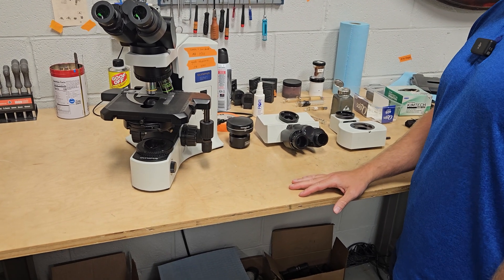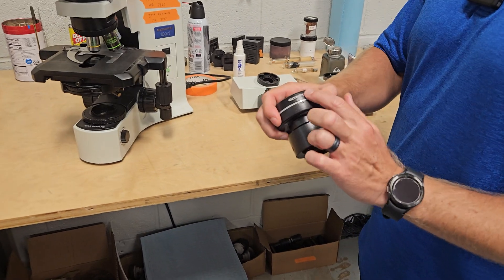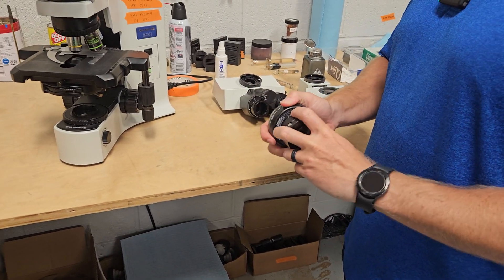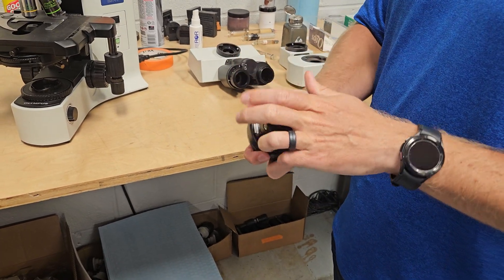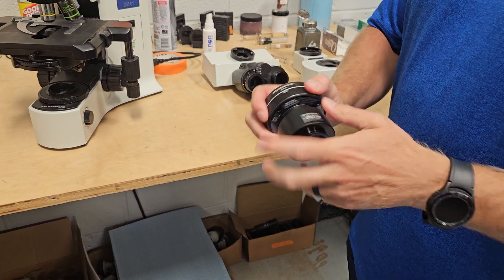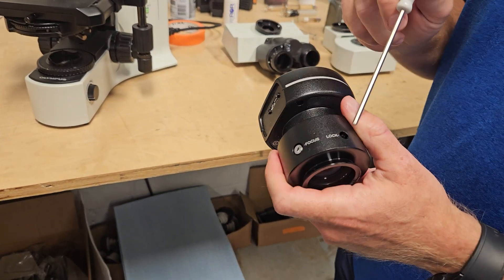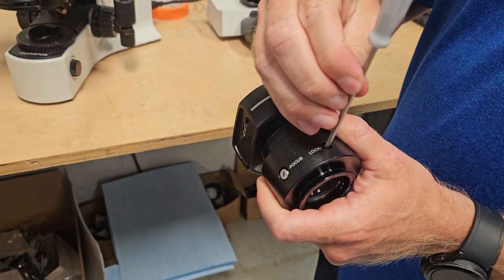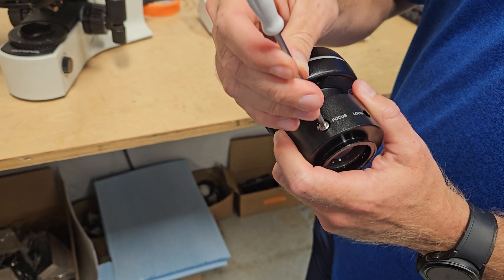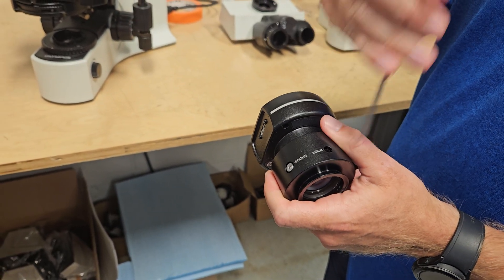So Mike's going to come in and we're going to show you a couple of ways. First, you've got to have a camera adapter and a camera. The camera adapter screws into the camera. On the Olympus adapters, you have a focus and a lock. You have to back this lock screw off to work this focus, and we'll show you how that works and why you need that here shortly.